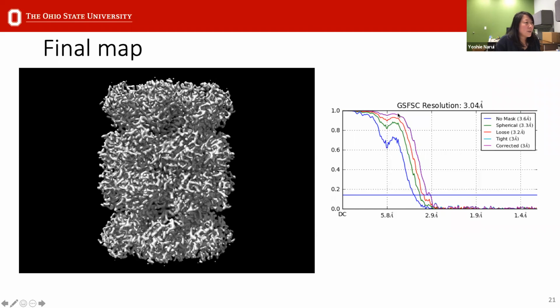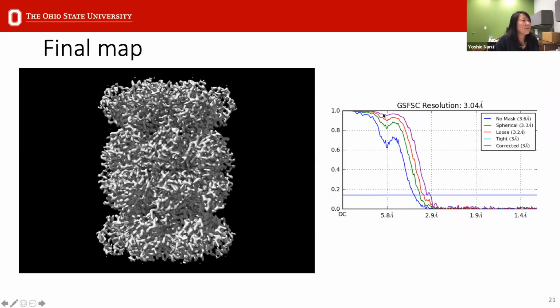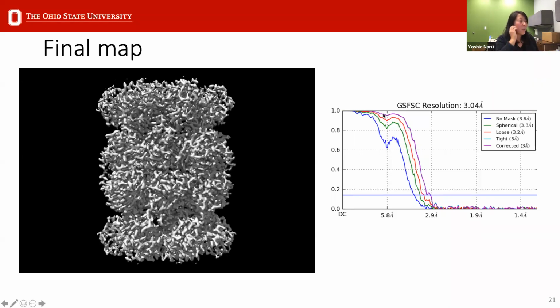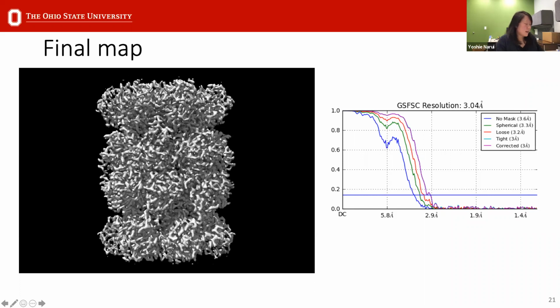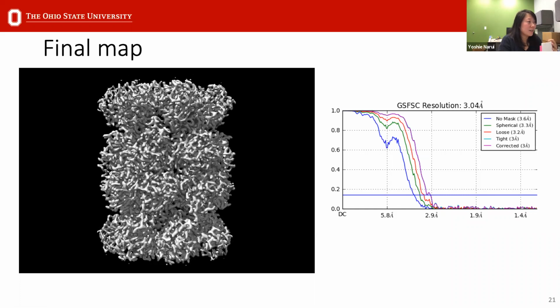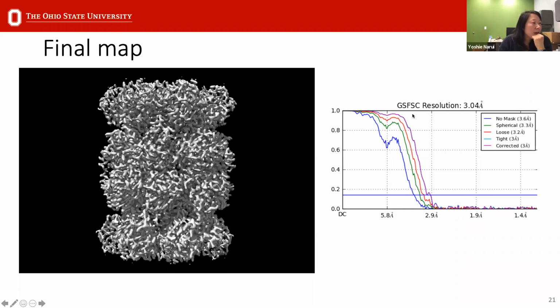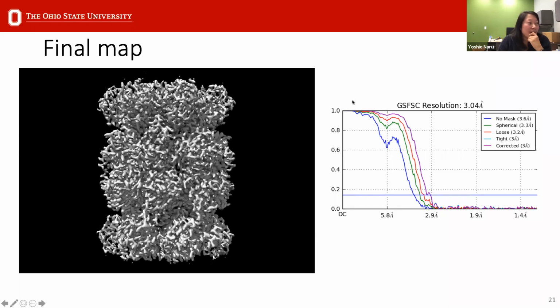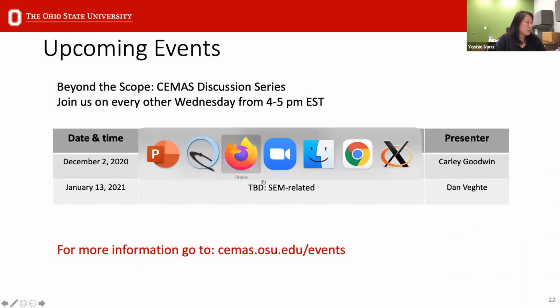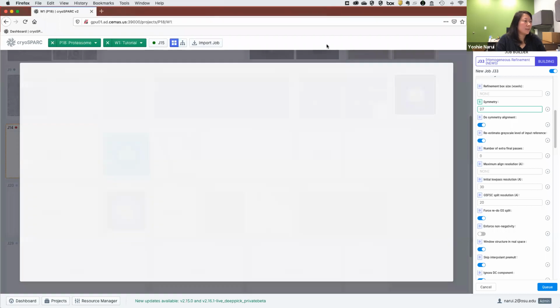For orientation maps, would the map with several hotspots be acceptable when the resolution kind of meets our needs? For orientation maps, you want to have enough coverage.